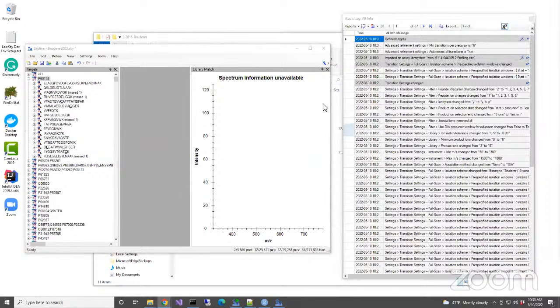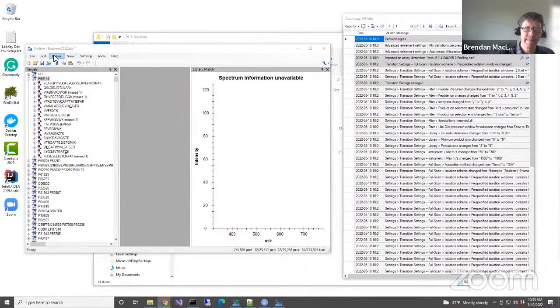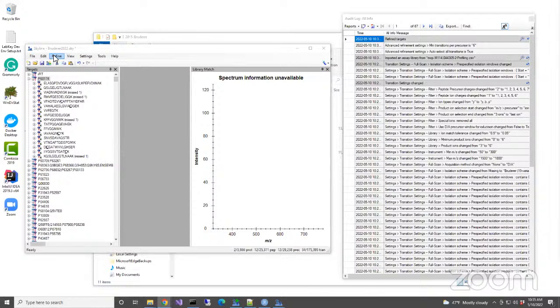Sorry to interrupt you. There was a question to see if you could show again how you did the refine and what was chosen in there. Yeah. Okay. So refine. There's one, and after that, there's one broader one as to how do you generate assay libraries or spectral libraries.